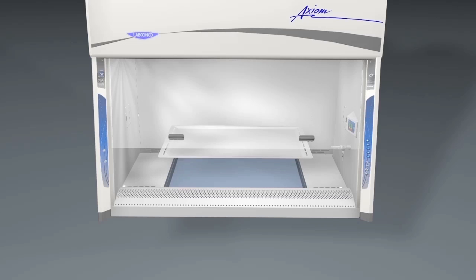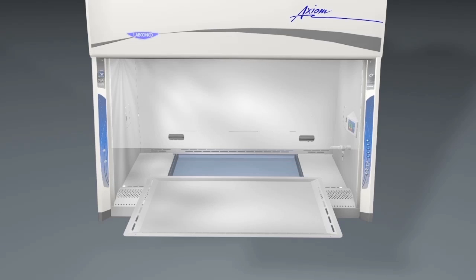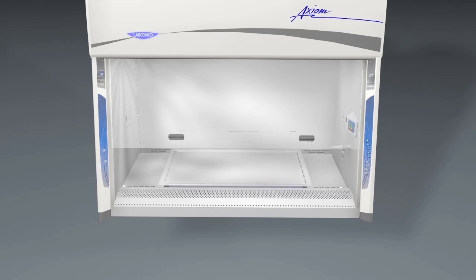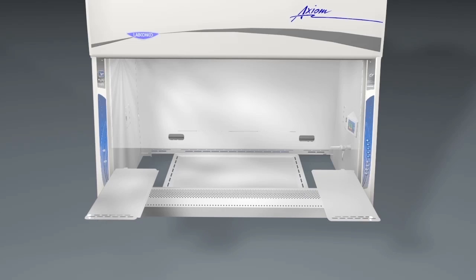The chemzone provides a clearly identified dished workspace designed to maximize workflow efficiency, while the wings provide staging zones for unused clean material and discarded or completed work.